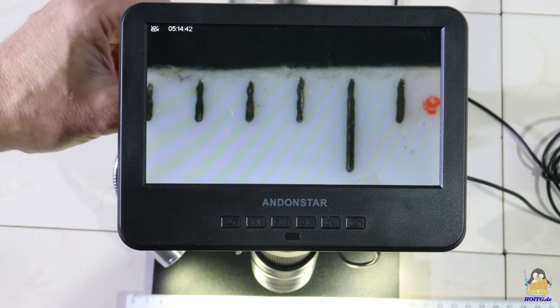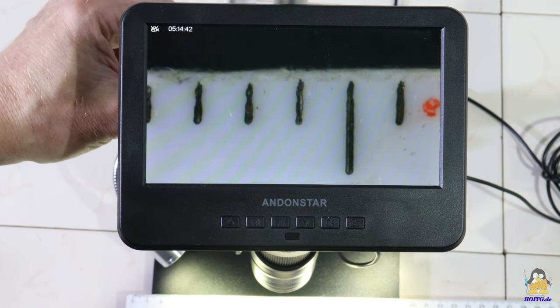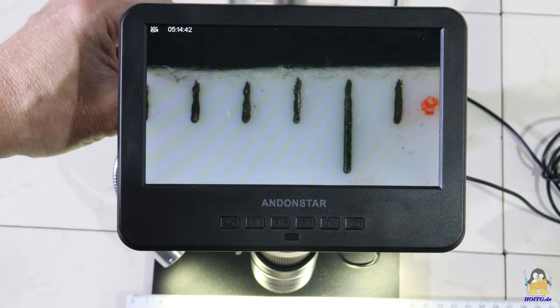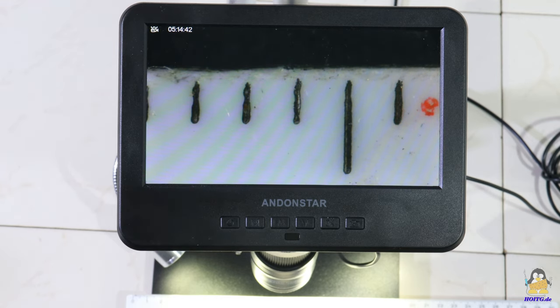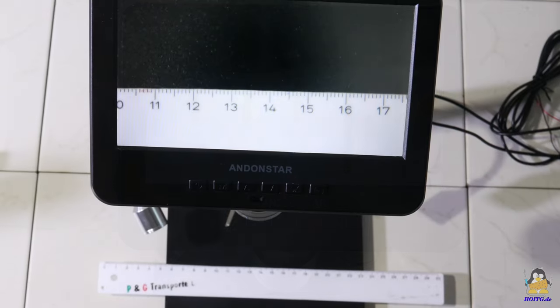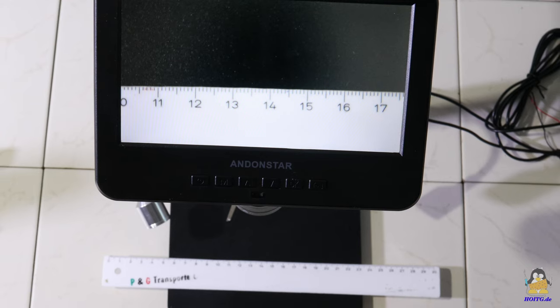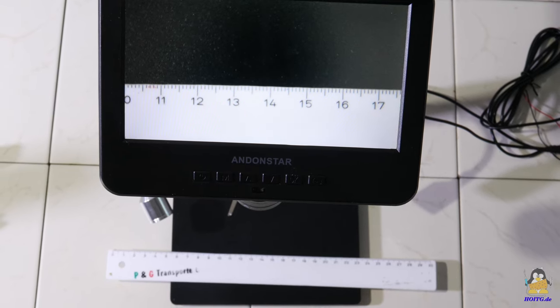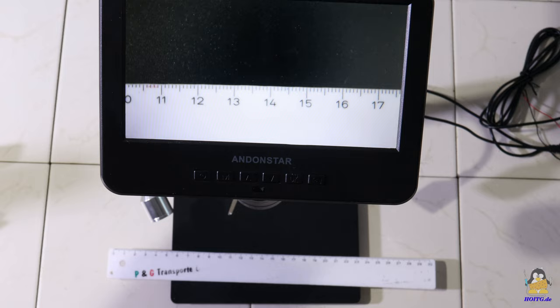At the minimum distance, only about 6mm of the ruler are displayed. With lens L, 76mm are captured at maximum height and so minimum magnification.